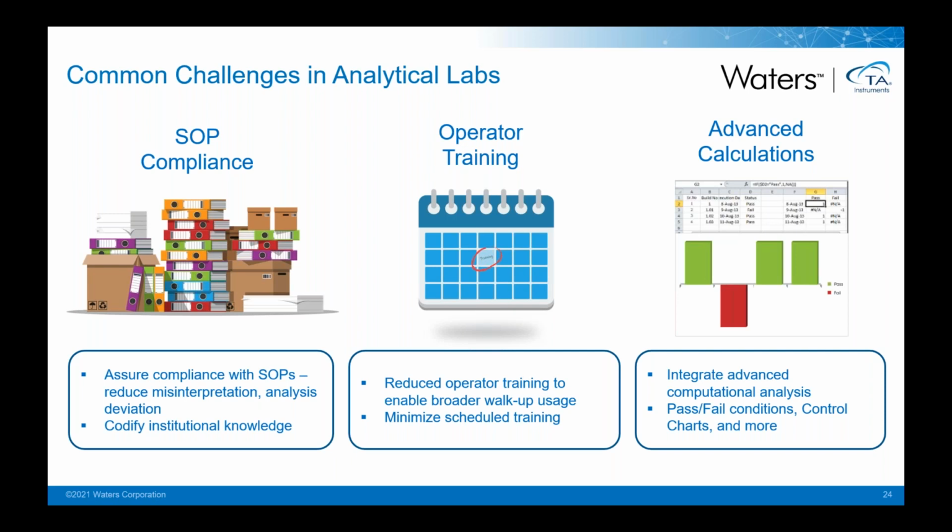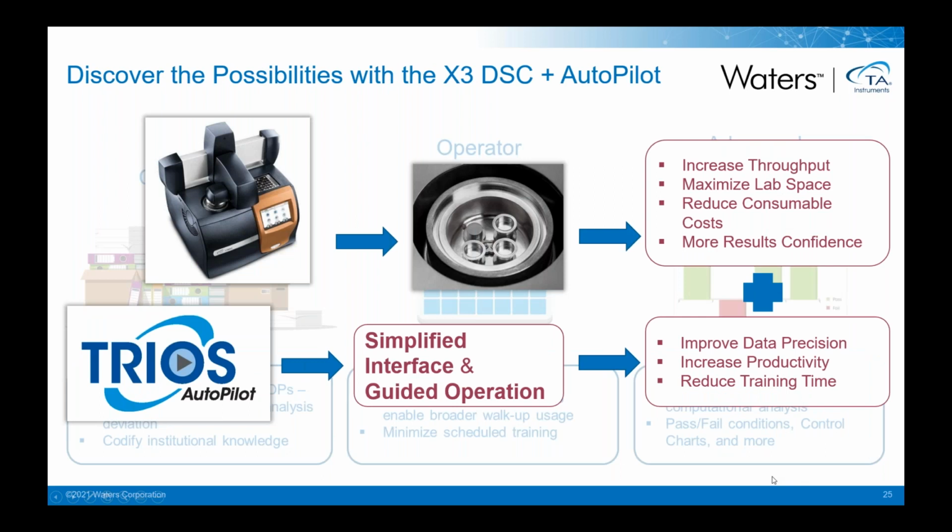Those things, reducing the burden there, is certainly helpful in productivity. And again, advanced calculations, whether we're just doing pass-fail conditions or whether we need to do some more advanced analysis or computational analysis on the data. Again, each lab is going to be different, and so maybe some or all of these are pertinent to you.